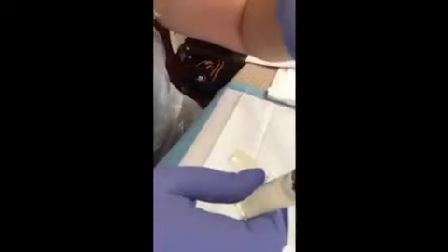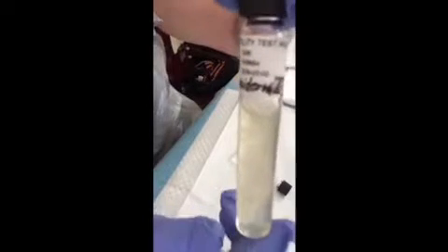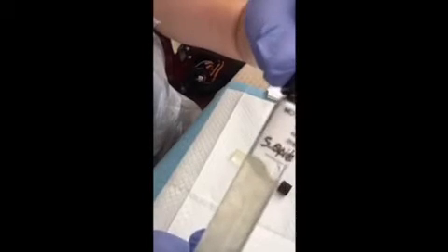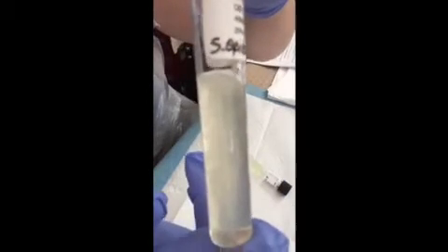Okay, so that is for E. coli. Now let's take a look at the S. epidermidis. Same thing, it looks like there's a little bit more bacteria in this one though. I did have a good amount of the bacteria in the paper clip to stab it. So maybe that's why there's way more. You can really see the movements and lines. It's a good amount of growth in there. Okay, so moving on.